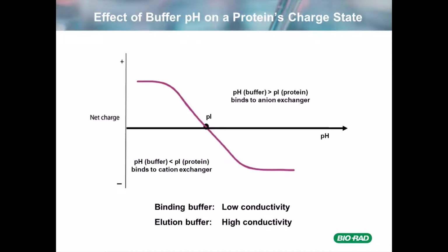This is a figure that you see often in the textbooks teaching protein chromatography. It gives you the guideline for the selection of an ion exchanger and the matching buffer to purify a protein that you already know its pI. Typically, we are preparing the feed in a low conductivity buffer to facilitate the binding of the target protein by the resin. Once we finish washing the impurities, we can use an elution buffer that contains high salt concentration to elute the target protein.